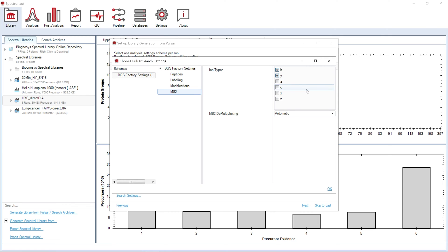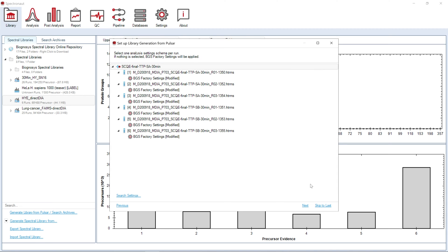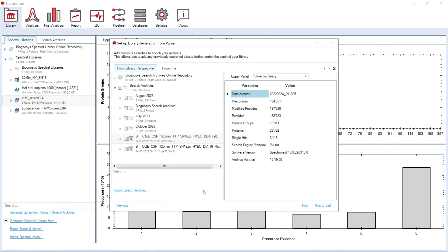You can select which ions should be searched for in your samples. Now we can select search archives from the previously searched data, so our new library will be more comprehensive without the need to reprocess all data together.